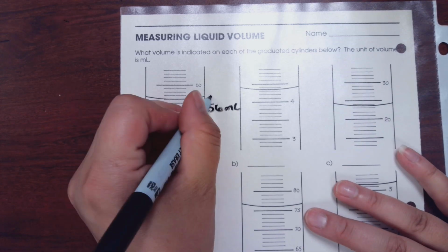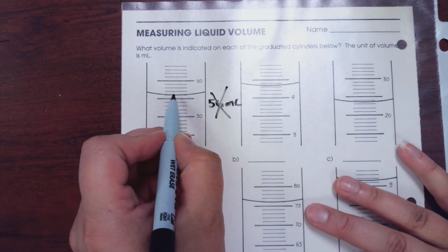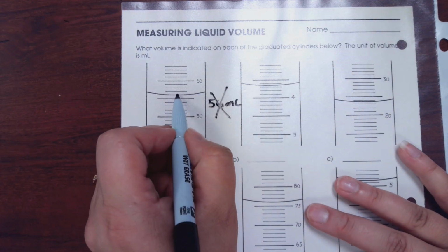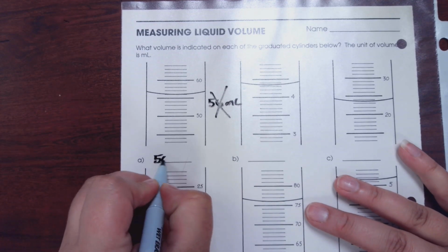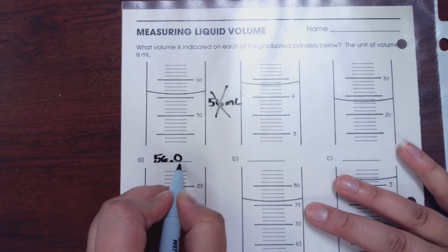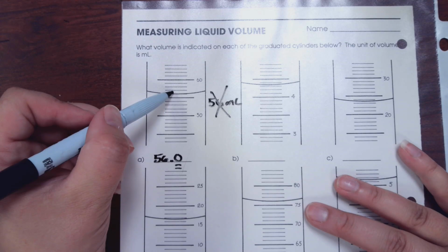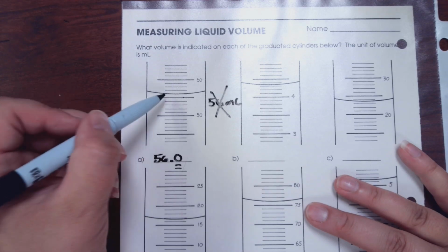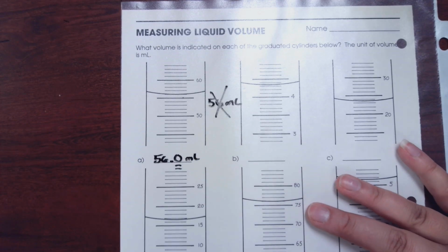That would be wrong. Your volume is always going to be the most lines you can measure, and then one more digit that you're going to estimate. So since this is right on the line, I would actually call this 56.0. This 0.0 tells me that it's right on the 56 line. It's not a little bit above it, kind of stuck in the middle between 56 and 57. It's right on that line. That's what putting that little 0 is. And then, of course, I always want to put my unit, milliliters.